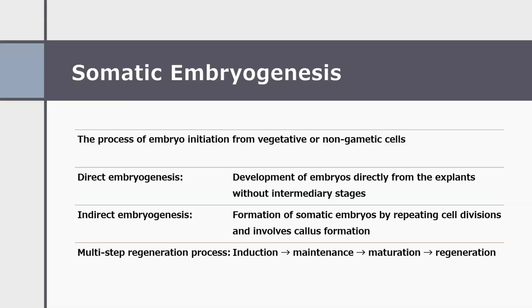In conclusion, there are several tissue culture methods, as different types of tissues require different conditions for the culture process to yield desired results. Plant tissue culture can be used for cloning, genetic modification of a specific plant, or simply to accelerate or increase the yield of the plant of interest. Although tissue culture is a complex process that requires a great deal of caution to avoid contamination, it is an investment that can offer rewards once you see the results.